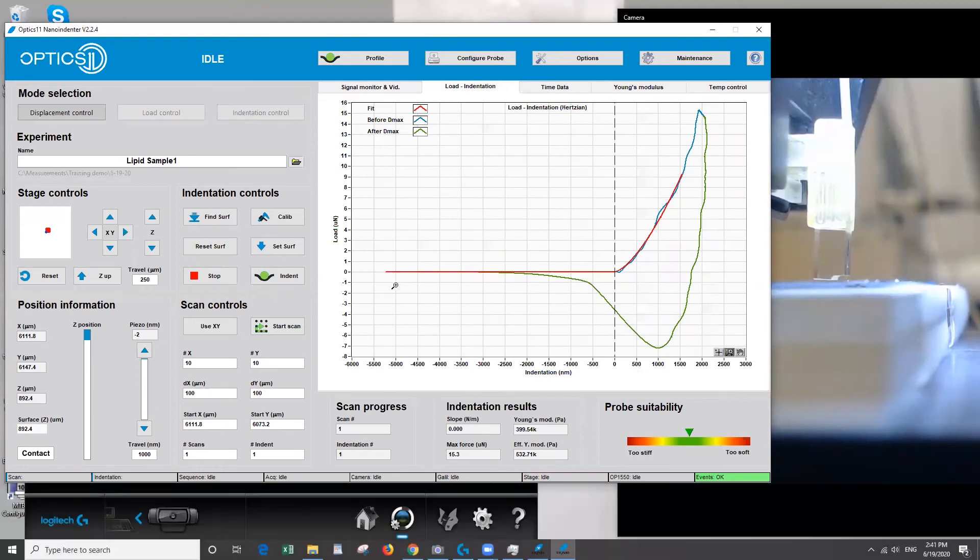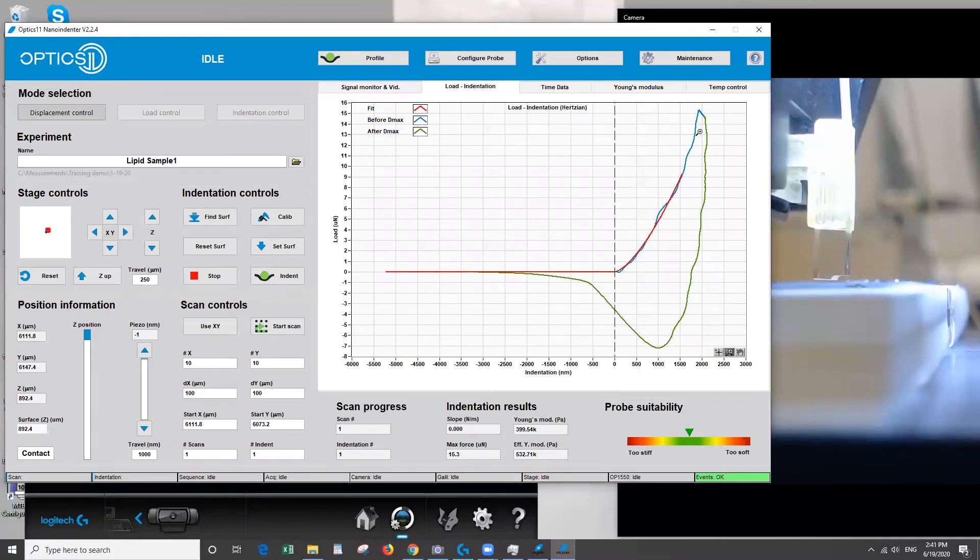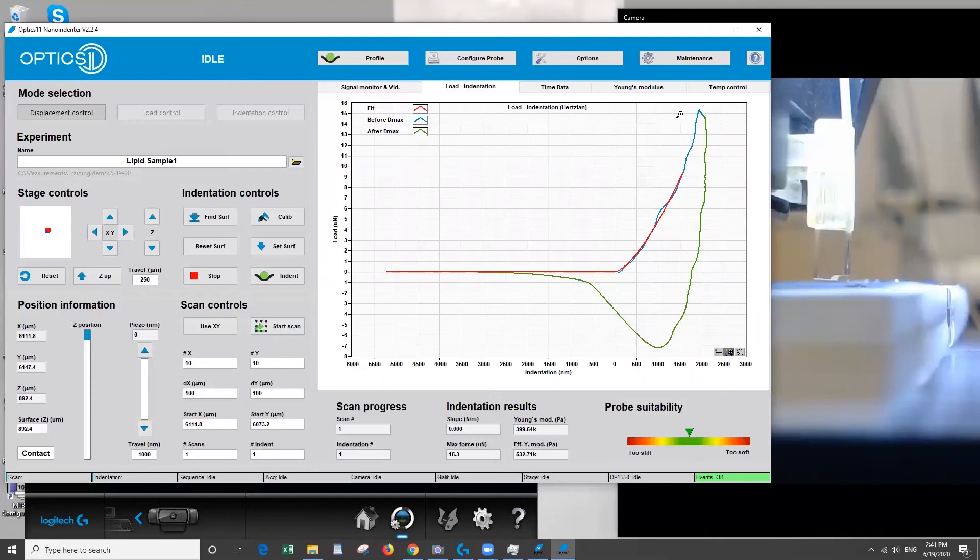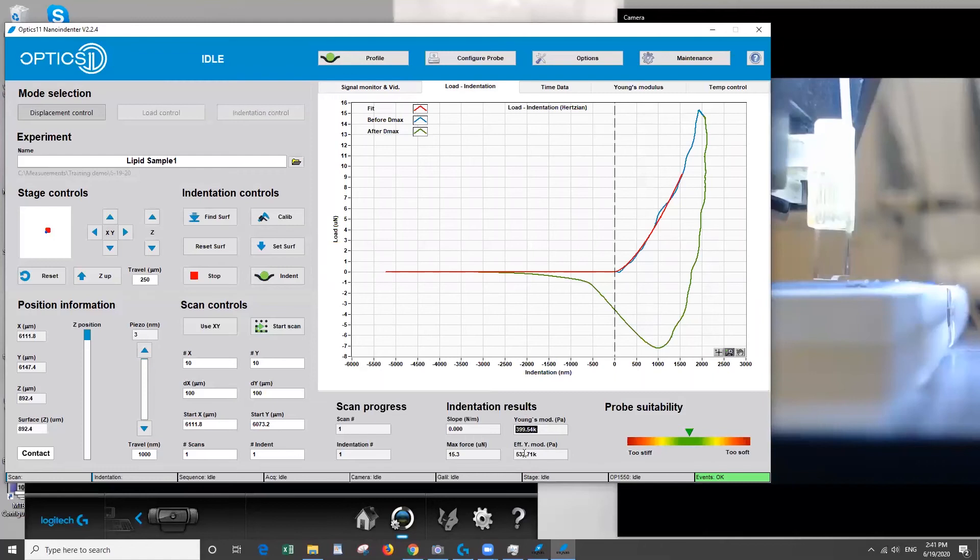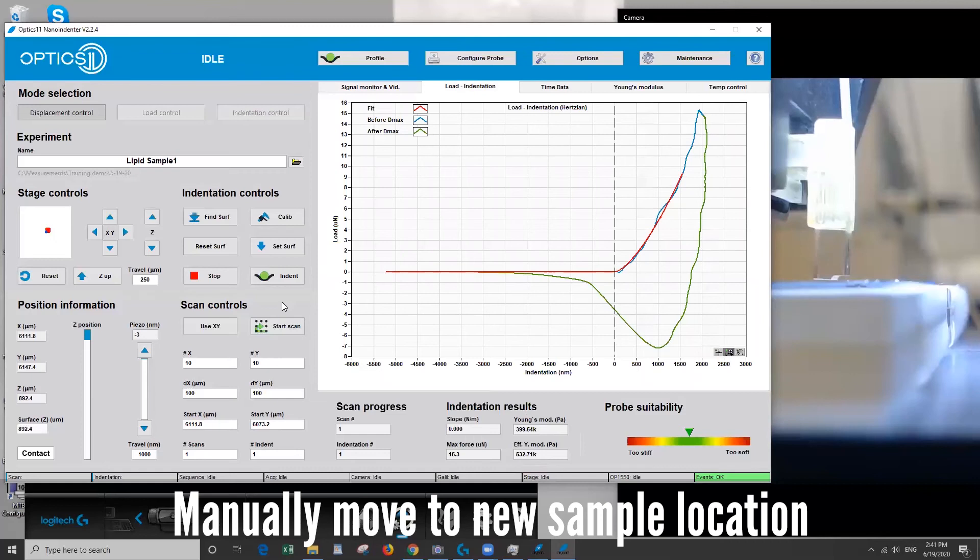And here you can see a force curve. It starts out of contact, indents onto the sample, and then retracts. And you can see here the lipid has quite a bit of adhesion to our probe which isn't ideal but for this case it's okay. You see this red line here. This is the fit to the curve. And you can see it's estimating the Young's modulus down here.